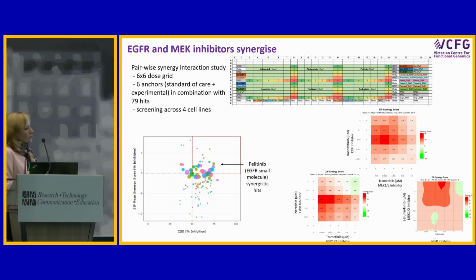So the synergy screening was a tour de force, actually. We have done a 6x6 dosing grid. We've got 6 anchors, or the standard of care treatment, and we've done them in combination of the 79 hits across 4 cell lines in the first instance.